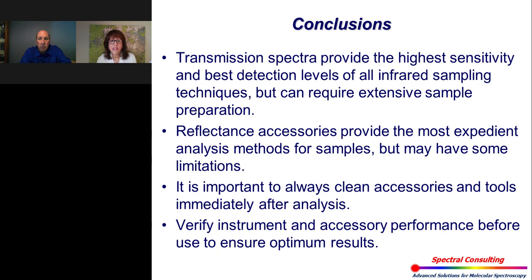Thank you for that. Looks like we have time for one more question. How do I verify the instrument performance for the accessory or analysis method?